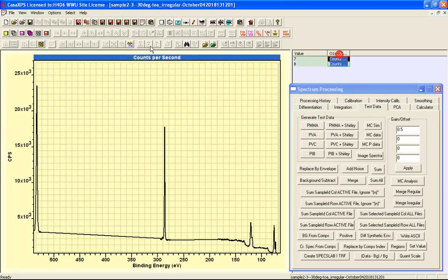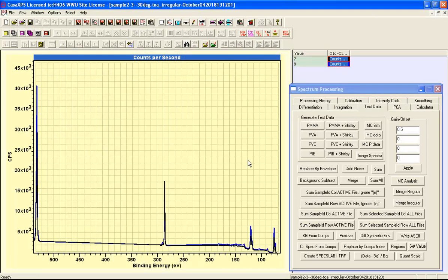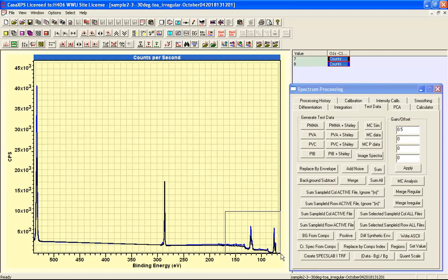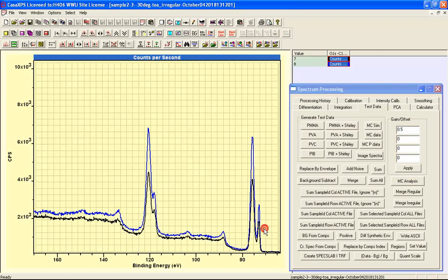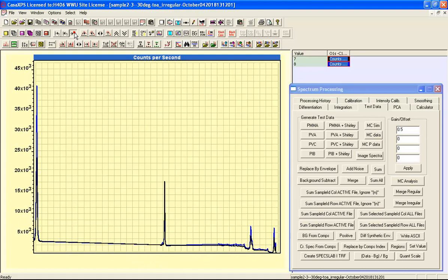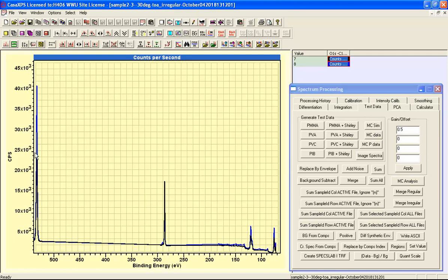So we have now two VAMAS blocks, one for each measurement, and these measurements include the data from the aluminium, the carbon, and the oxygen. So it will be possible to create a peak model that will relate information from the aluminium directly to the oxygen, for example.